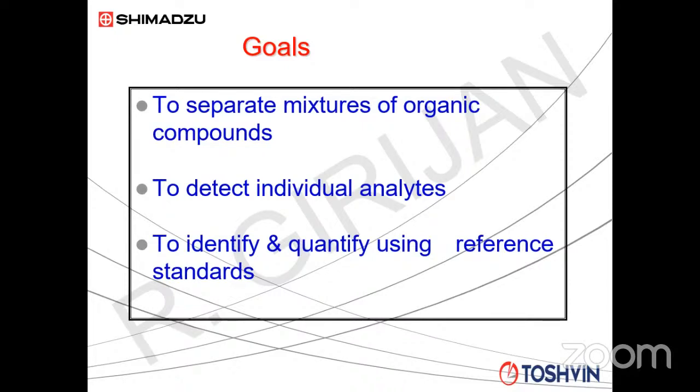So from that perspective, most of the inorganic compounds are totally non-volatile. You talk about, for example, potassium dichromate, sodium chloride, magnesium sulfate. These are all salts. It can be an oxide, it can be a salt, it can be a chelate, it can be anything. It's an inorganic complex out of purview of GC because they're all totally non-volatile materials. They just cannot be analyzed by GC. But GC can be used for very, very few inorganic compounds which are already in the gaseous form.